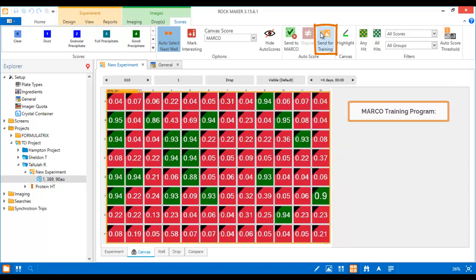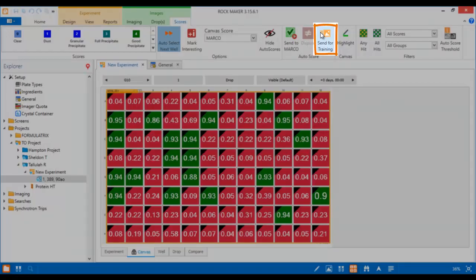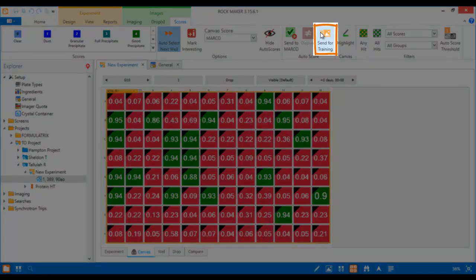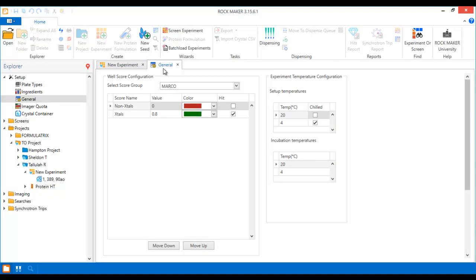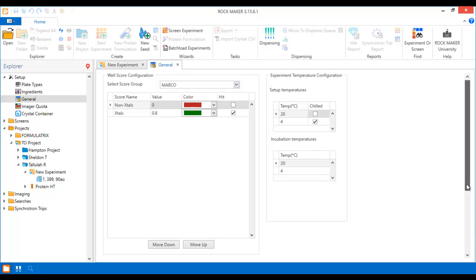To send your images for Marco training, click the Send for Training button. You can enable this button in the General Setup by selecting the Send Images for Marco Training and Improvement option.